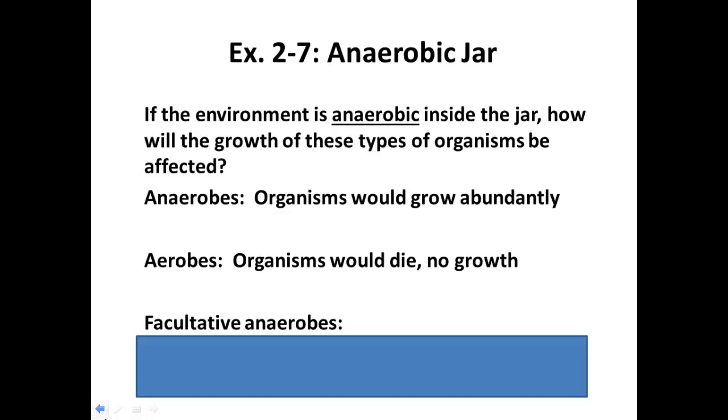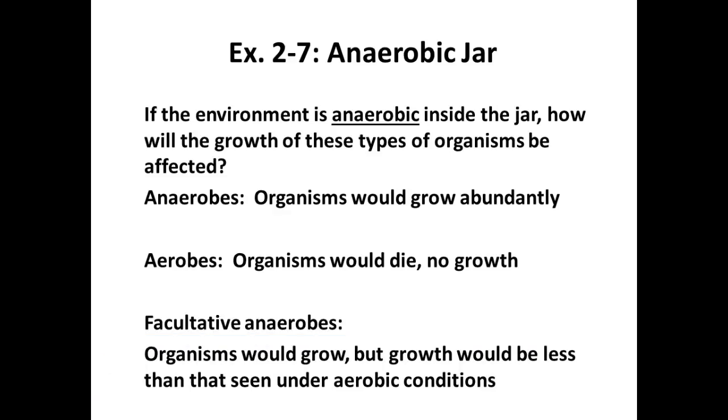What's going to happen to them? If you take a facultative anaerobe and you stick it in this anaerobic jar and make this environment anaerobic, they're going to grow, right? Are they going to be as happy as they are in this aerobic environment of our classroom? No, they're going to grow less, but they're still going to grow, right? Because in this case, they're going to ferment because there's no oxygen for aerobic respiration.